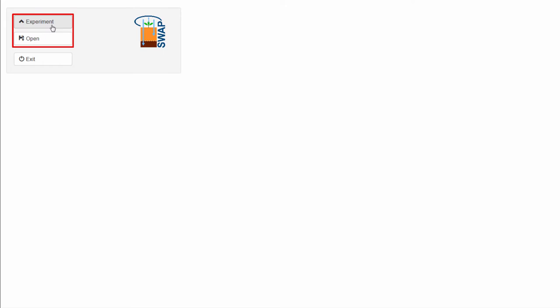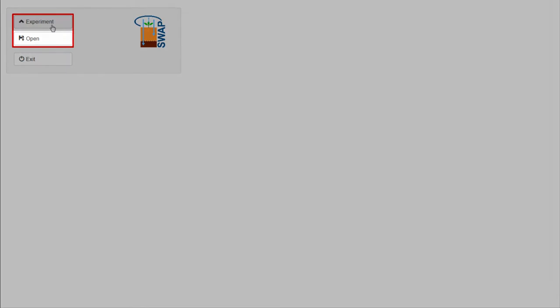Here, you can find all the buttons that are related to managing your experiments. Since there is currently no experiment open, only the button OPEN is visible.